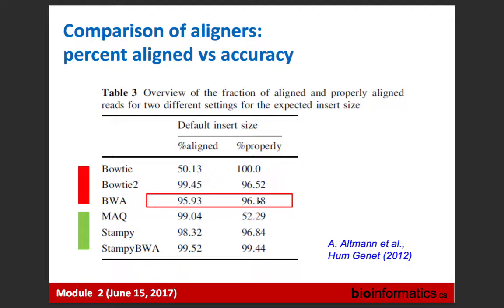Because multiple times, we would like to come back and back and back to our original FASTQ files. And if our aligner doesn't keep all reads, it means we have to double the space needed to store our data. The alignment file, if it contains all reads, should be recoverable. We should be able to come back and recover all reads as FASTQ, in case maybe I don't like this aligner anymore and I would like to use another aligner. But we will talk about this more.